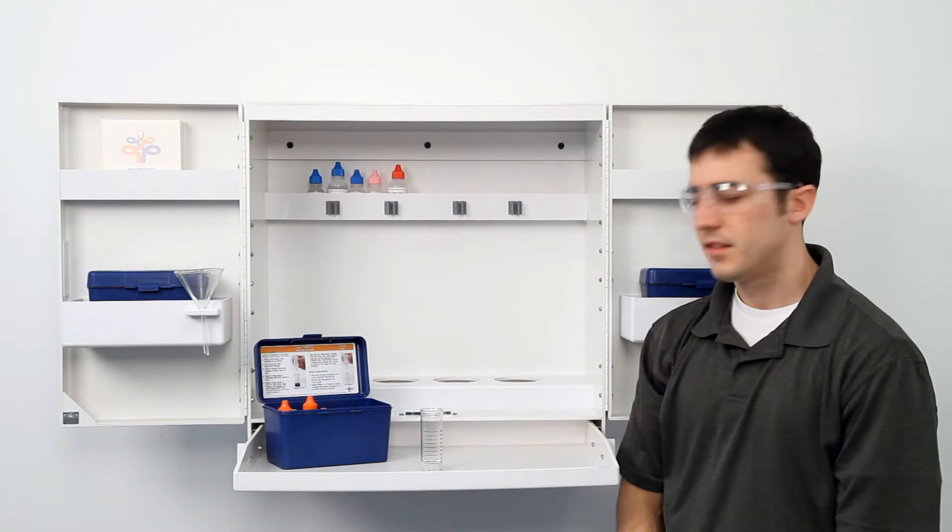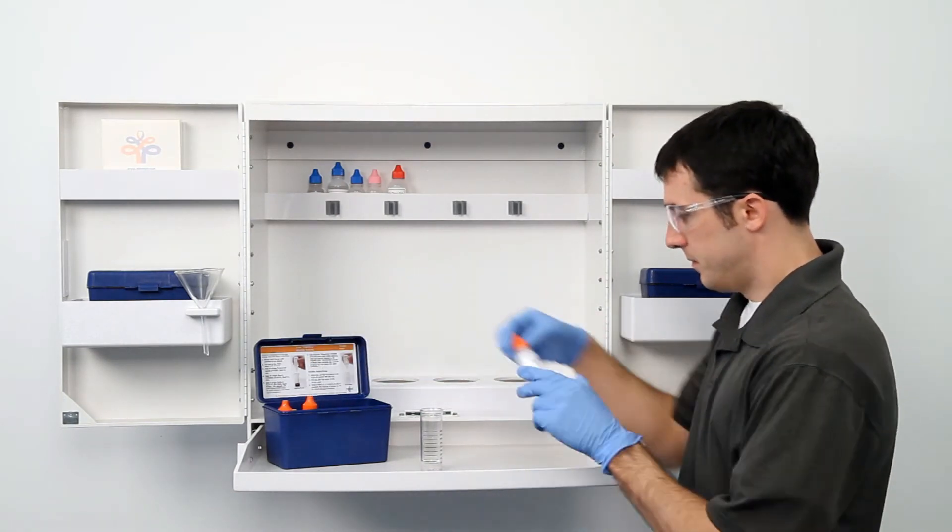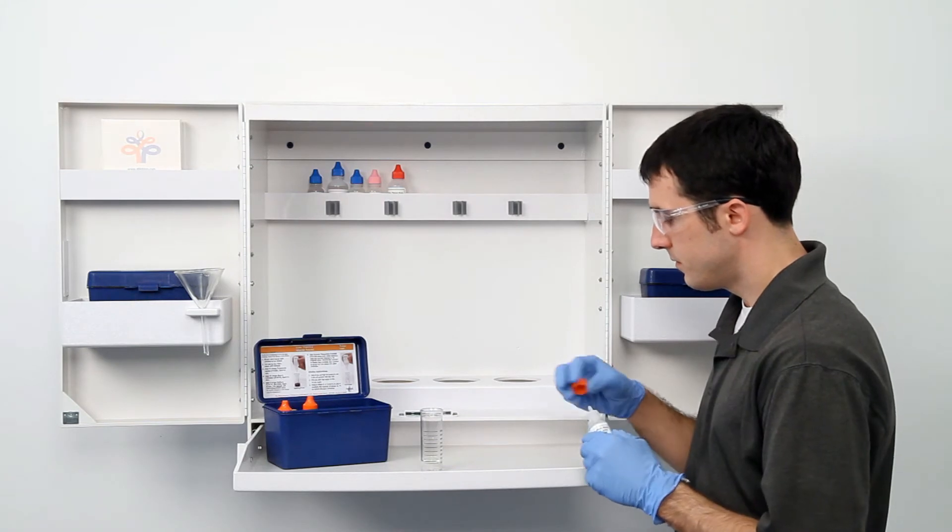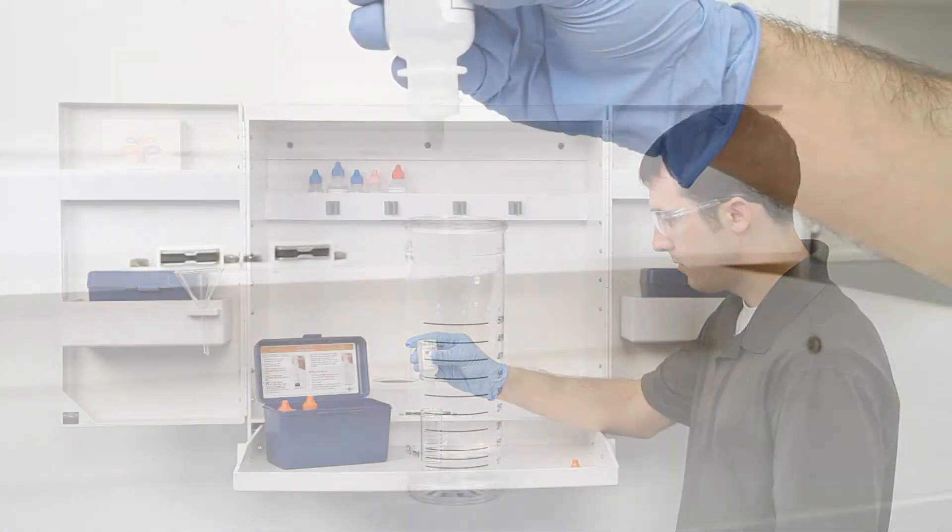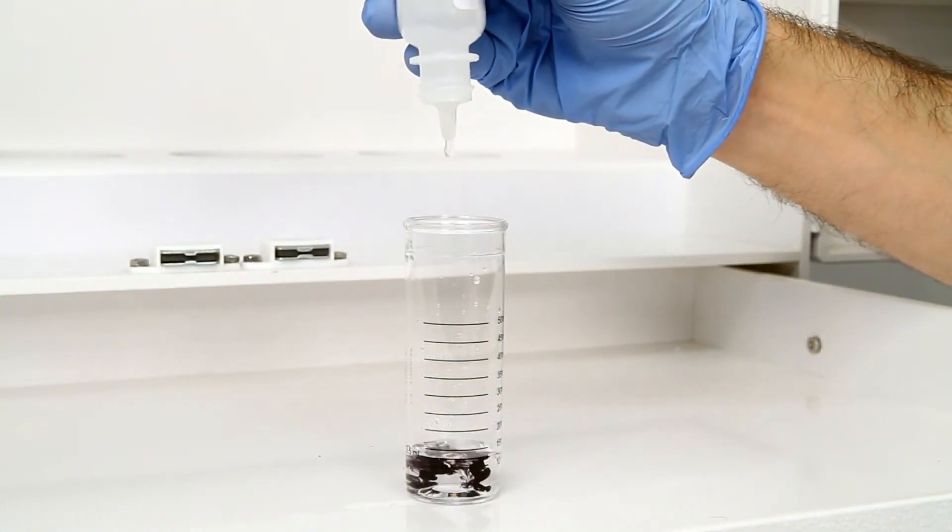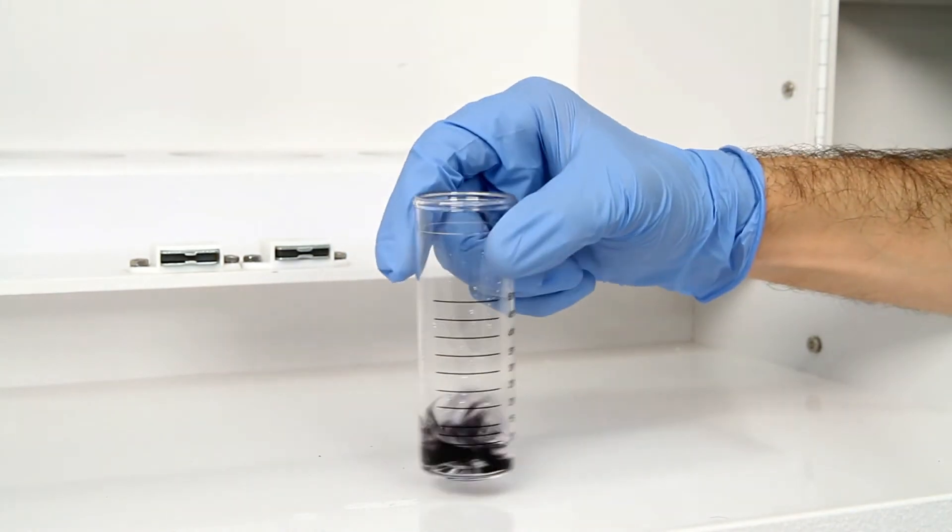The next step is to add three drops of sulfuric acid 50%. Remember to hold the bottle vertically and swirl the vial five seconds to mix the reagents. If chlorine is present, the sample will turn a blue-black color. In caustic solutions, more drops may be necessary.